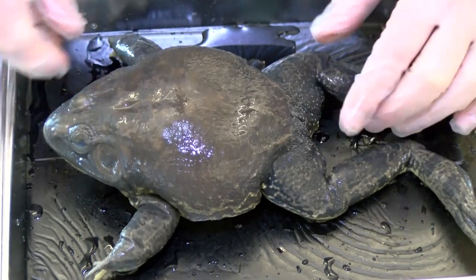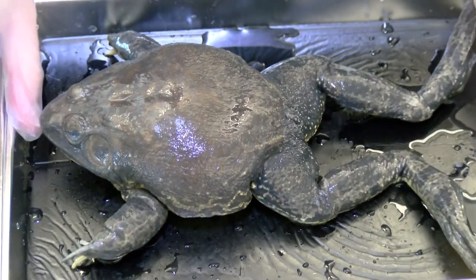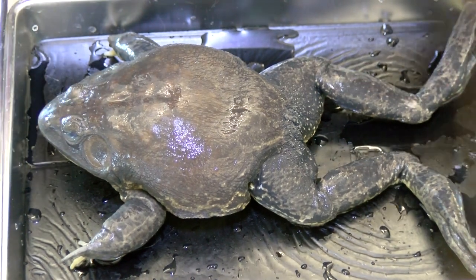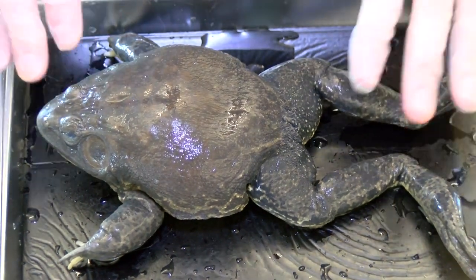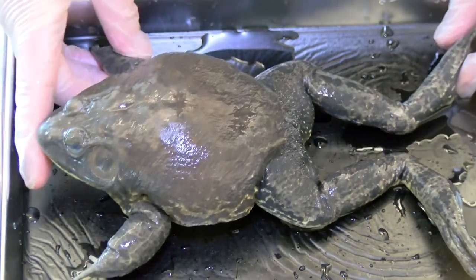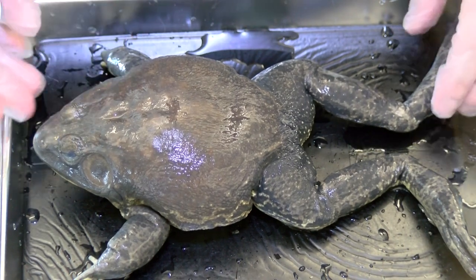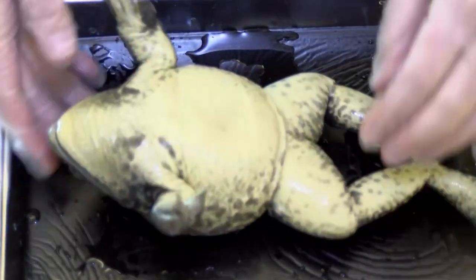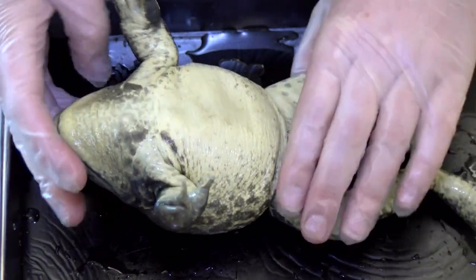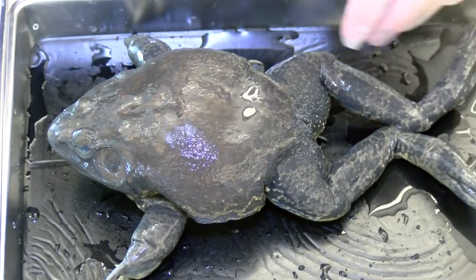We are going to be dissecting a frog today, grade eights. I'm going to start with this frog as it has not been opened up already. We'll start with the external anatomy. The top view of a frog is known as the dorsal view and the underside is the ventral view. We're going to be doing our dissection on the ventral side, but first let's look at some of the parts.